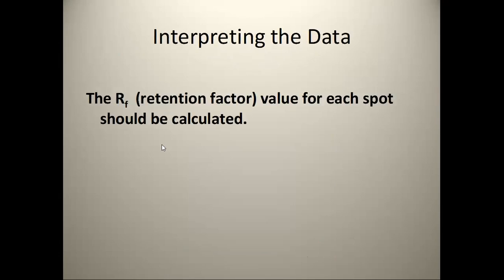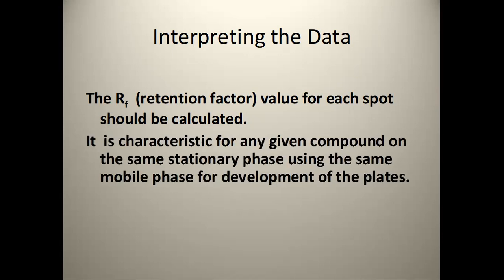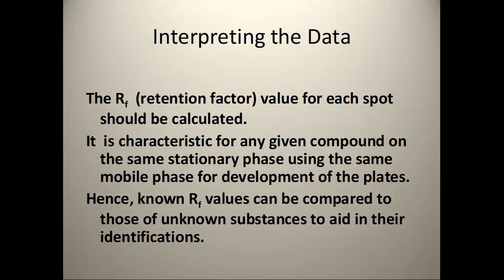I look for another site where I can show you yung RF value, how to calculate the RF value, which will be part of your exam. So the RF or retention factor value for each spot should be calculated. So it is different for any component. So it is characteristic for any given compound on the same stationary phase using the same mobile phase for development of the plates.